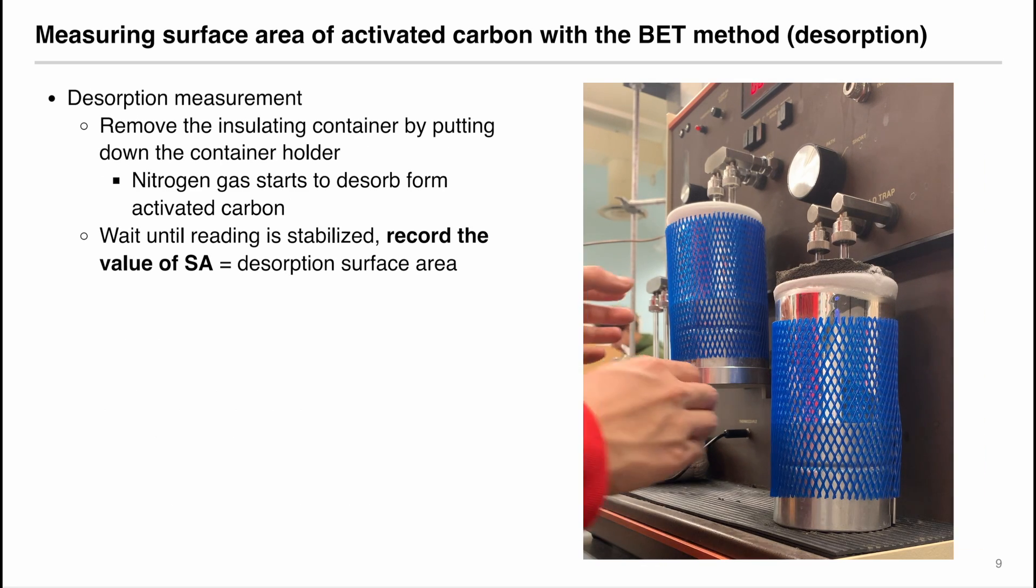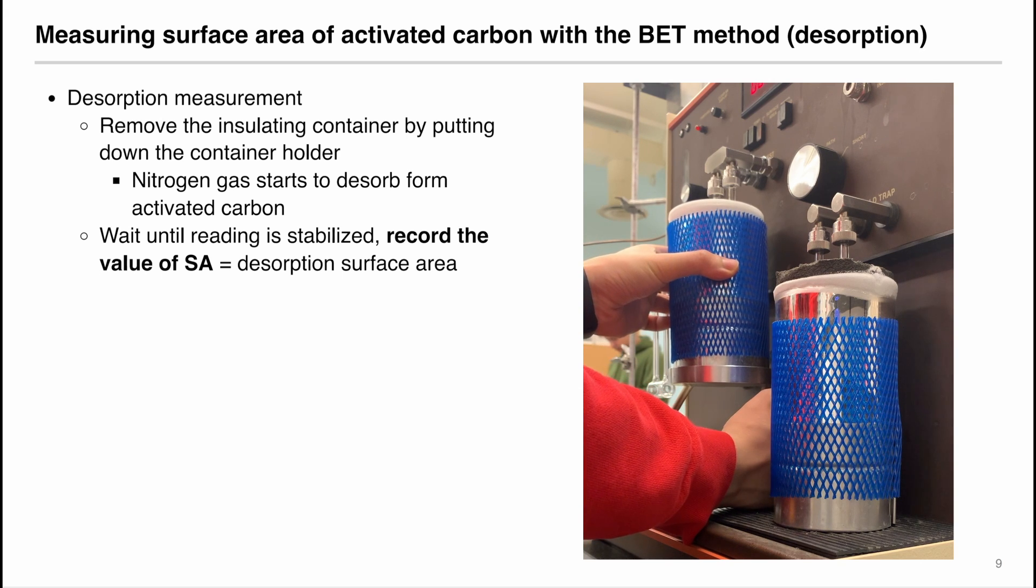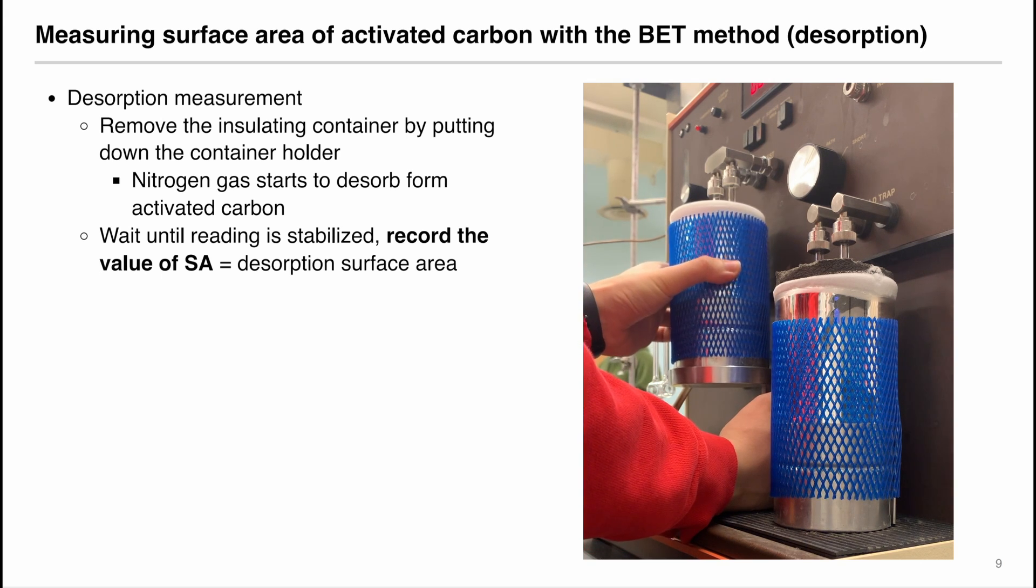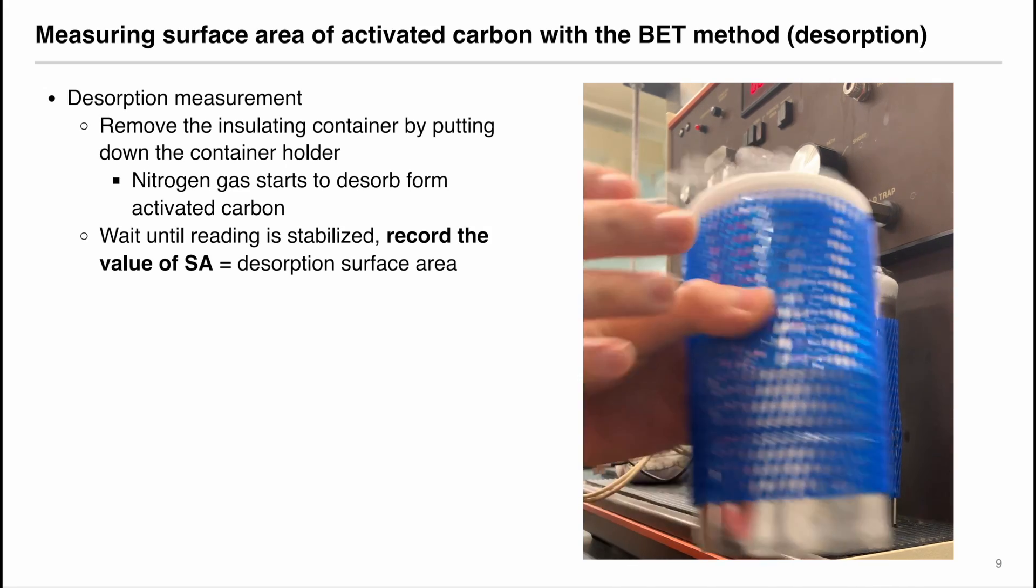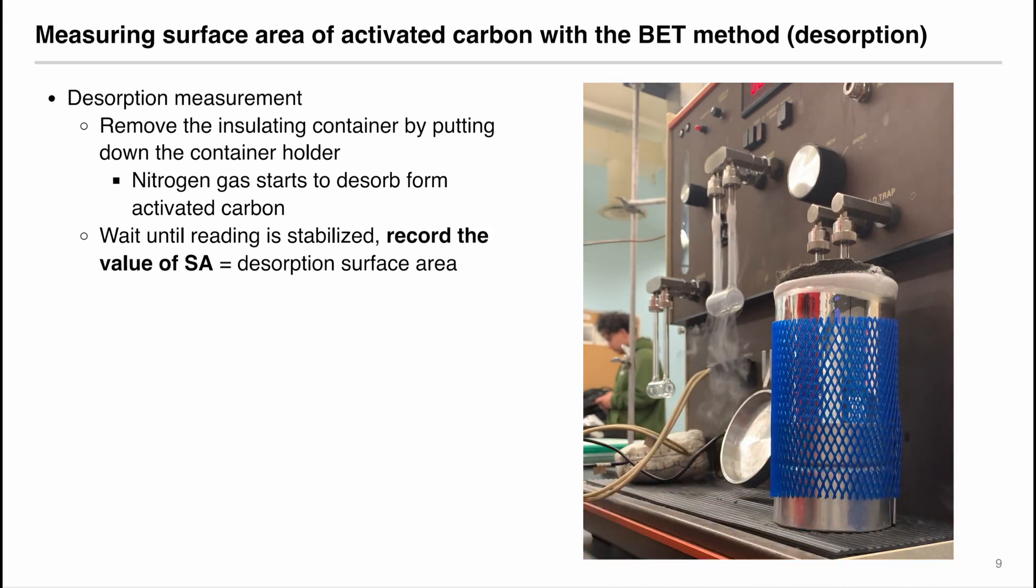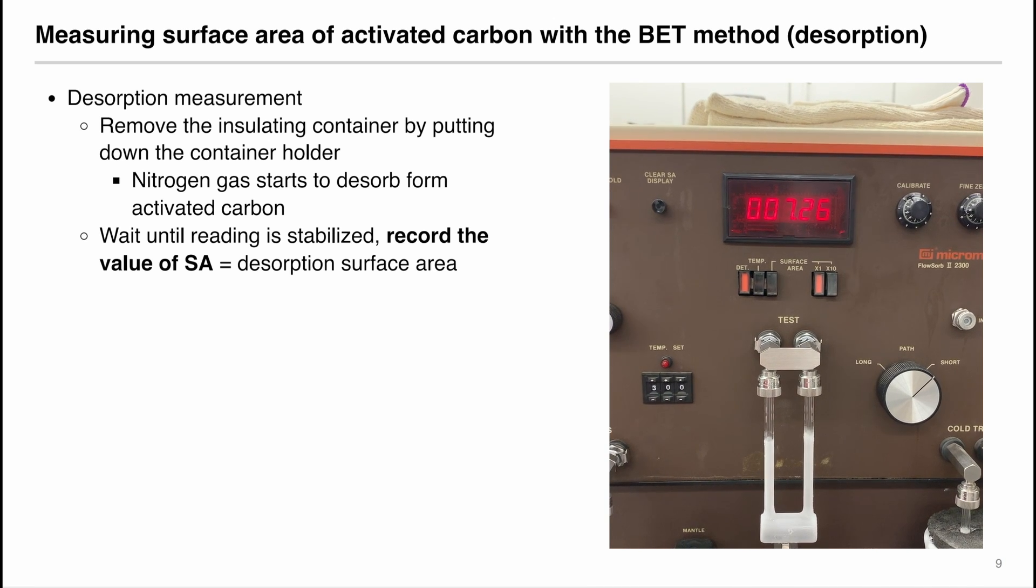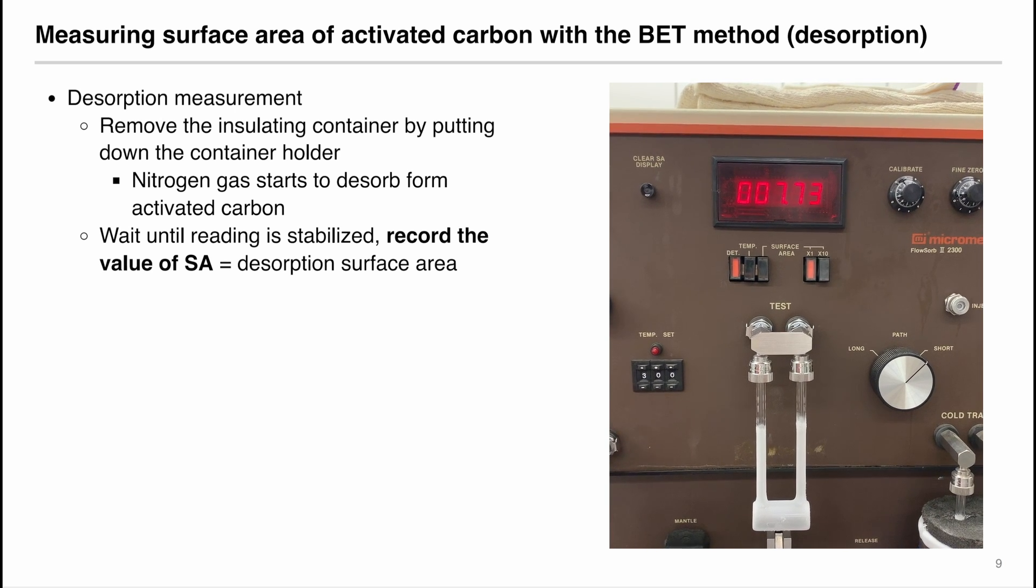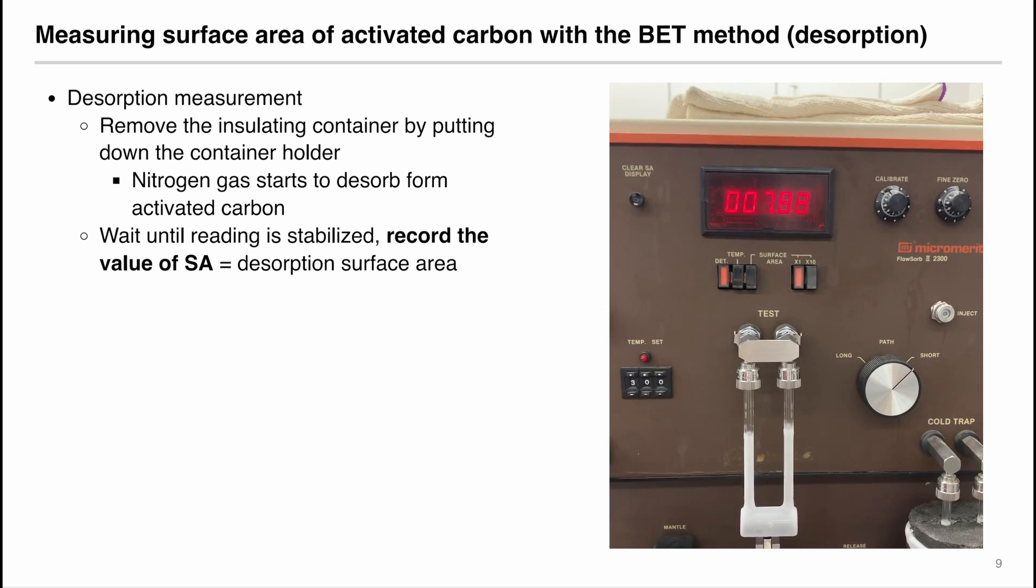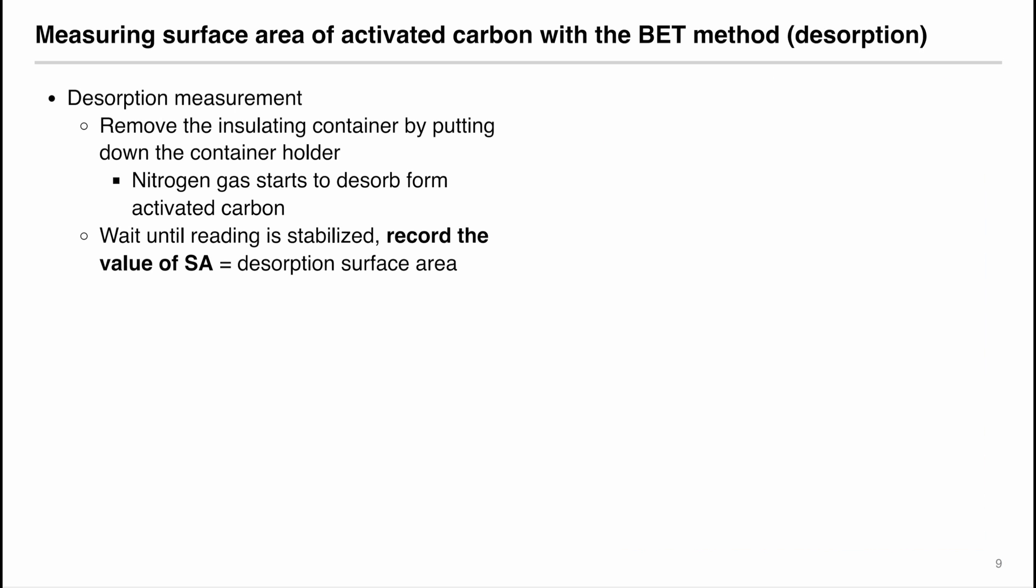Then we can perform the desorption measurement by removing the insulating container by putting down the container holder. Then the nitrogen gas will start to desorb from the activated carbon. Wait until the reading is stabilized and then record the value of the SA display. And that value is equal to the desorption surface area. Make sure you report both the adsorption and desorption surface area in your lab report. But the industry standard is to use the desorption surface area as the final reported value.